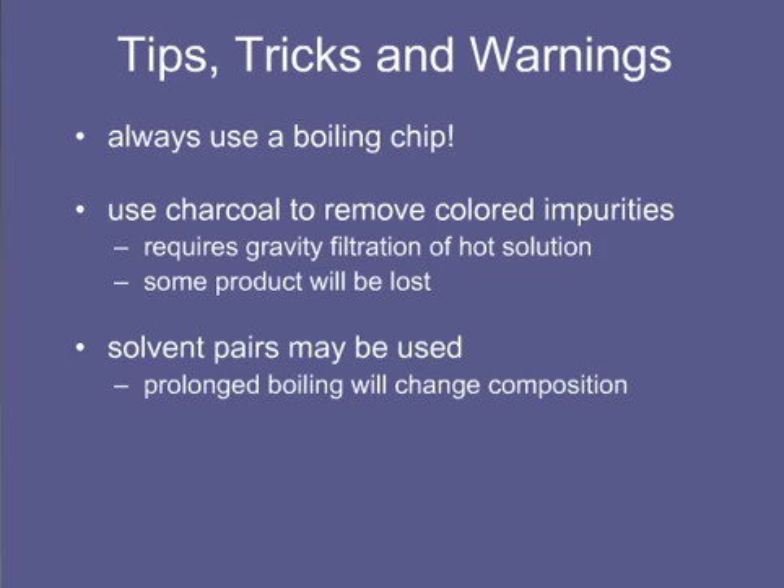Occasionally, a layer of oil might form during a crystallization. This is actually the desired solid. It has either come out of solution as an oil because there is a large amount of impurity — remember, impurities lower the melting point of a solid — or it has melted because it was heated beyond its melting point. If a product crashes out of solution because the solvent is too polar or maybe not polar enough, it may come out as an oil rather than as a solid.